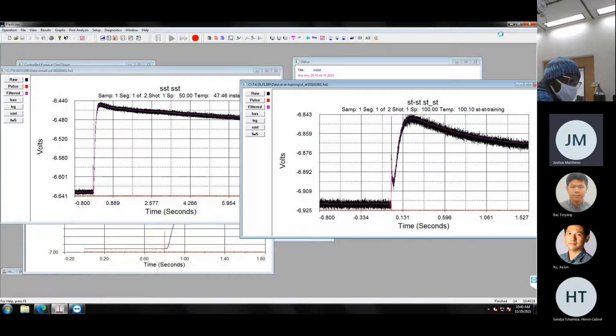You need to be able to absorb as much of the energy from the laser as possible. So it needs to be a dark surface, so the capsule would need to be painted, and it would need to be a very low thermally resistant, high diffusivity material to get as much of that energy through the sample as possible, right? And again, the applications folks will be able to help you with sample prep as far as the liquid samples go.